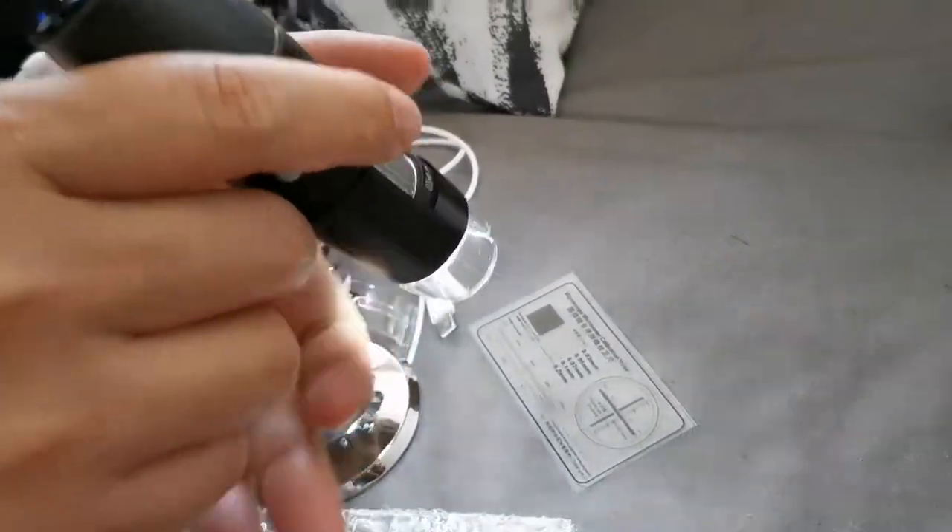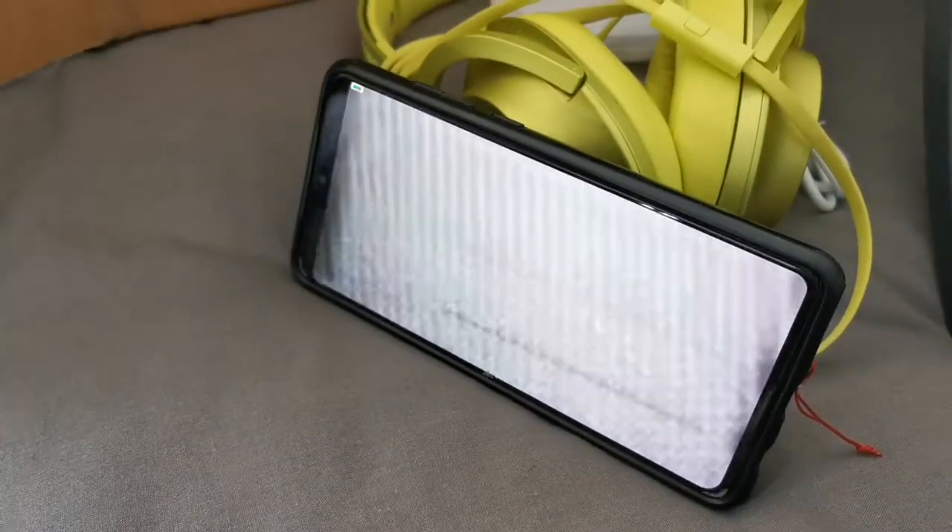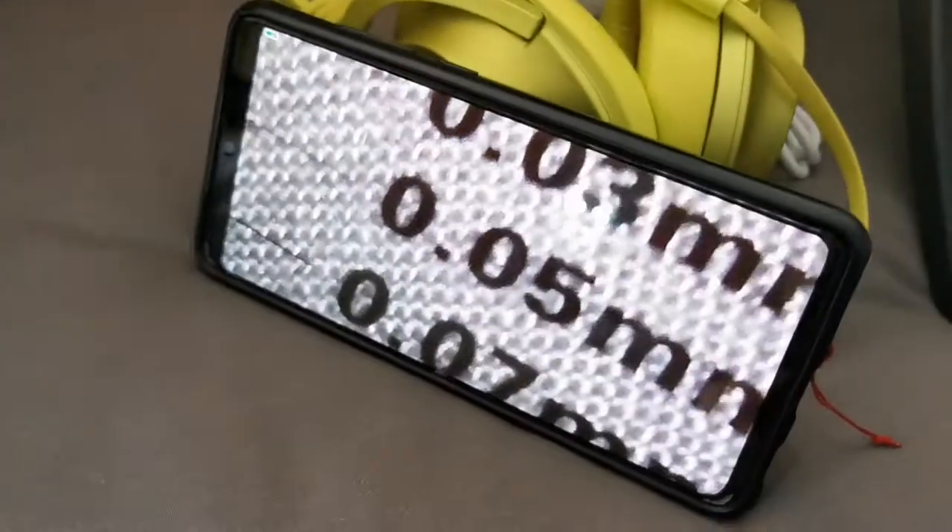It's a Wi-Fi digital microscope where you can connect to your cell phone. This is the small fonts that Dino's trying to project — and look at that! It's a new way to use a microscope; it's no longer the old-fashioned way. Cool, right?